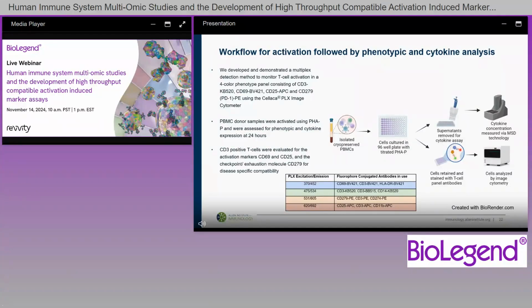After the supernatants were removed, we stained the cells just like we would stain cells for traditional flow cytometry. We used best practices in flow, as well as the same reagents such as BioLegend's antibodies, FcX TrueStain, and we also fixed the cells using BioLegend's FluoroFix. Also, we integrated automation for liquid handling to maintain consistent results.